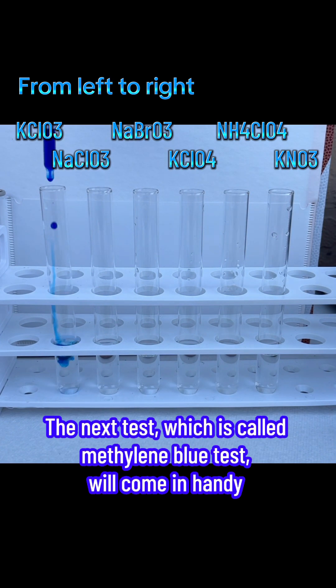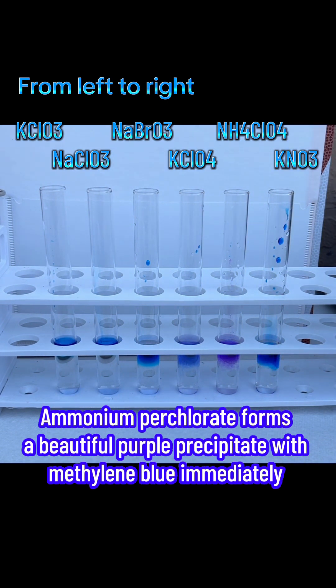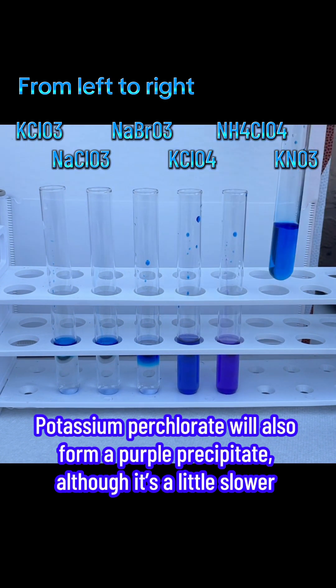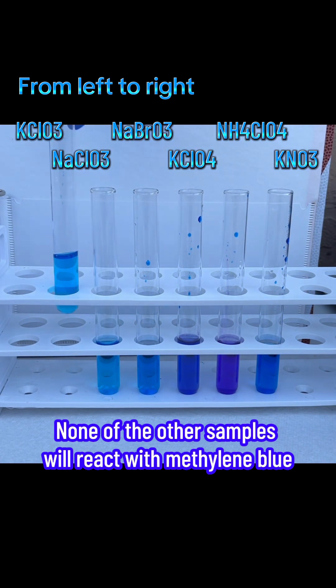The next test, which is called the methylene blue test, will come in handy. Into each test tube, several drops of methylene blue solution was carefully added. Ammonium perchlorate forms a beautiful purple precipitate with methylene blue immediately. Potassium perchlorate will also form a purple precipitate, although it's a little slower. None of the other samples will react with methylene blue.